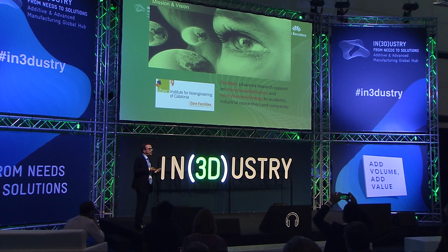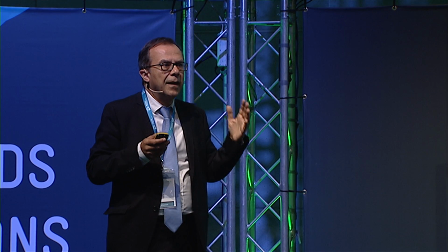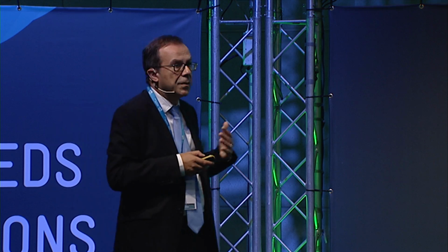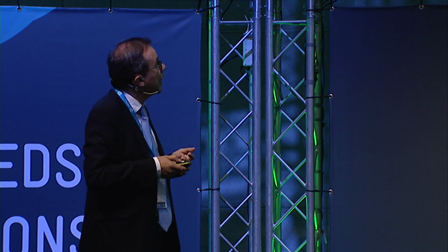And what is our experience at IBEC? So IBEC is an Institute for Bioengineering. So we work with biological material, and one of our main axes is tissue engineering. So all the problems concerning 3D cell cultures, development of scaffolds, and combination of biomaterials with cells and stem cells. In this sense, also as the engineering part, we use many different types of technologies. One of them, we are specialized in 3D bioprinting.